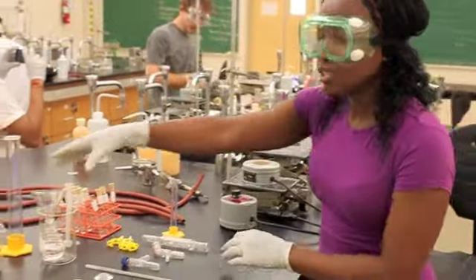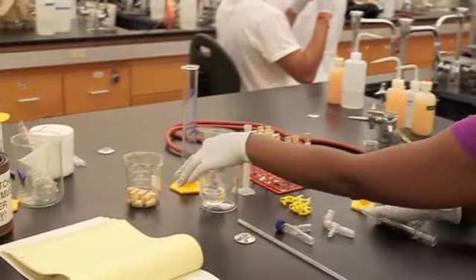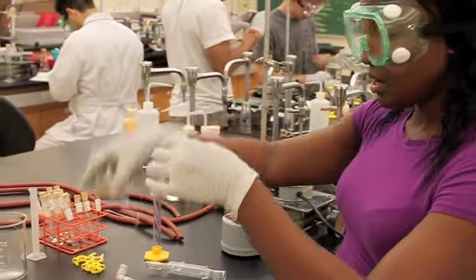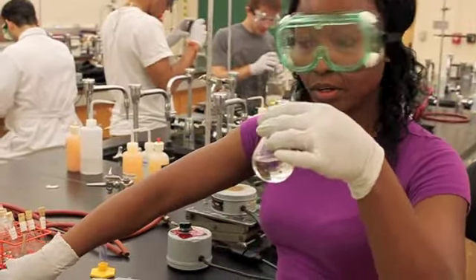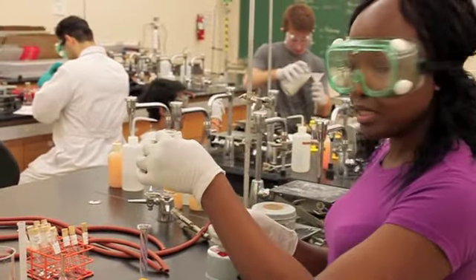Today we're doing the simple distillation procedure. For the simple distillation, you need several components. Glassware: you need your round bottom flask, 50 milliliters. You'll pre-weigh your 3 compounds. We're using cyclohexane, hexane, and toluene today in a 1:1:1 ratio for 30 milliliters.